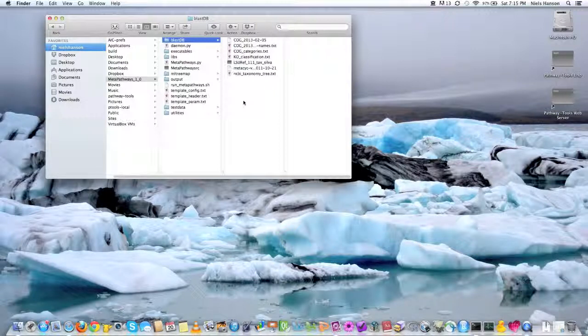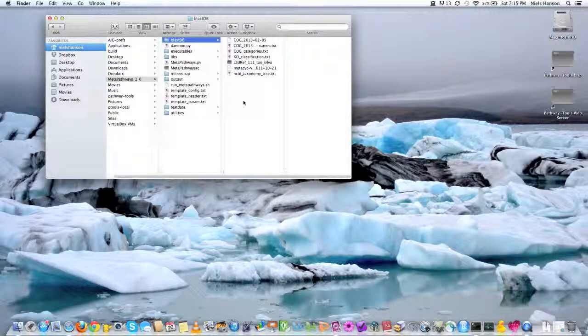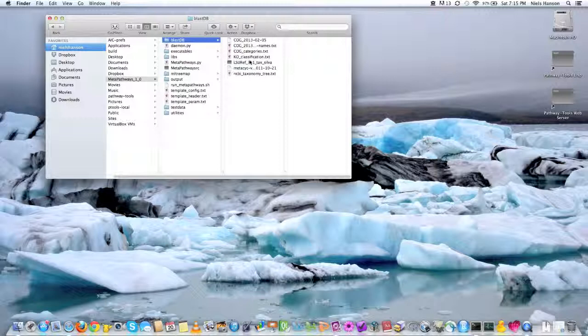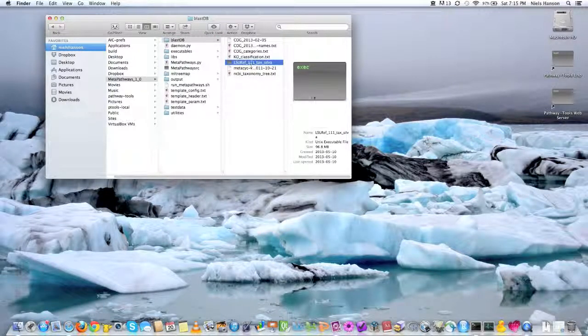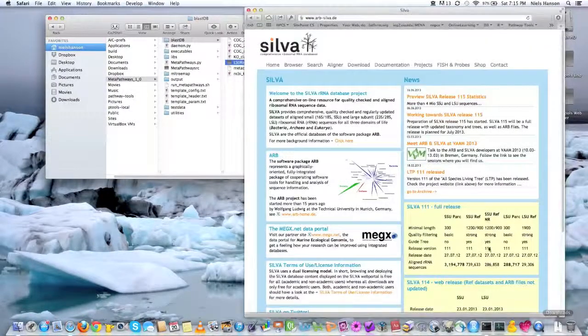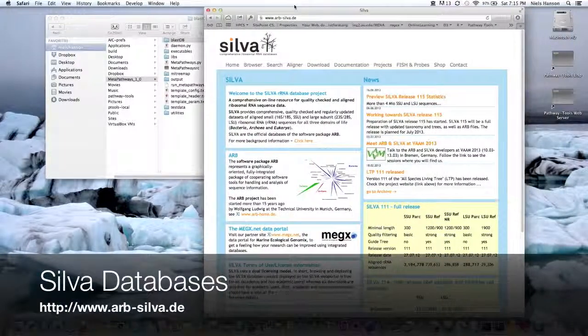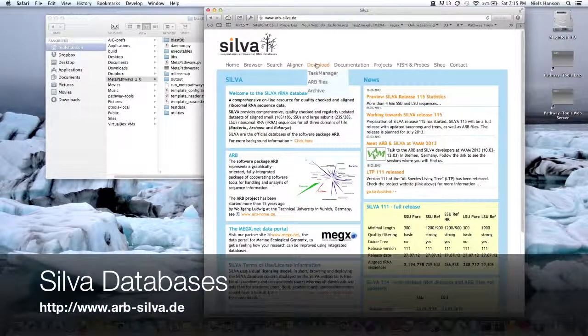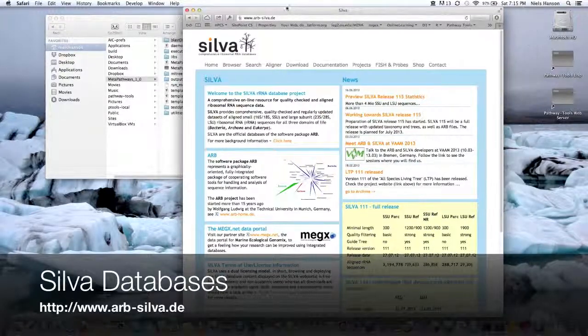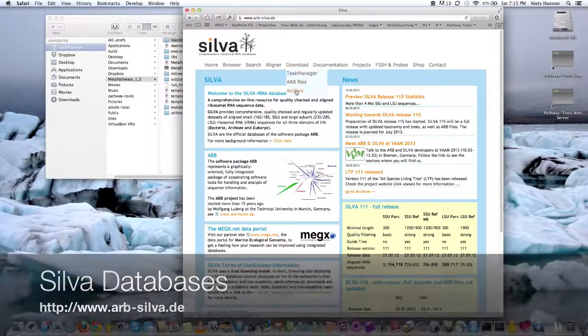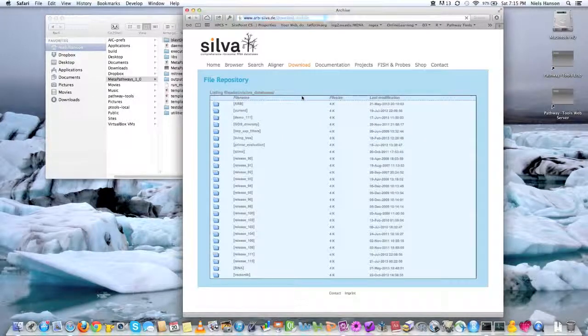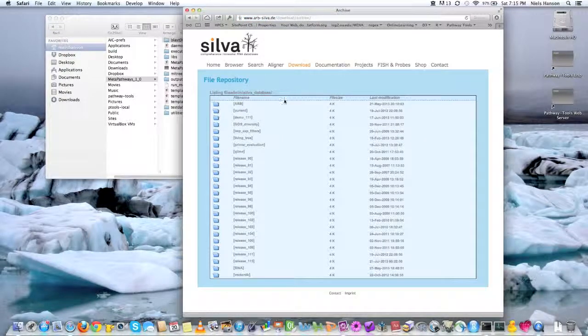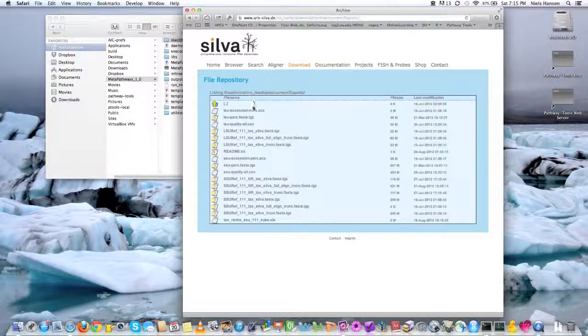However, you can download these things from a website, and we're just going to show you in general how that works. So I know I gave you guys the large ribosomal subunit of the Silva database, but there's also the small ribosomal subunit, which is 16S, which is actually the one that's more important. So if you navigate yourself to the Silva database, and then you go to download and archive, and then you click current, and exports, and here, SSUref underscore 111.